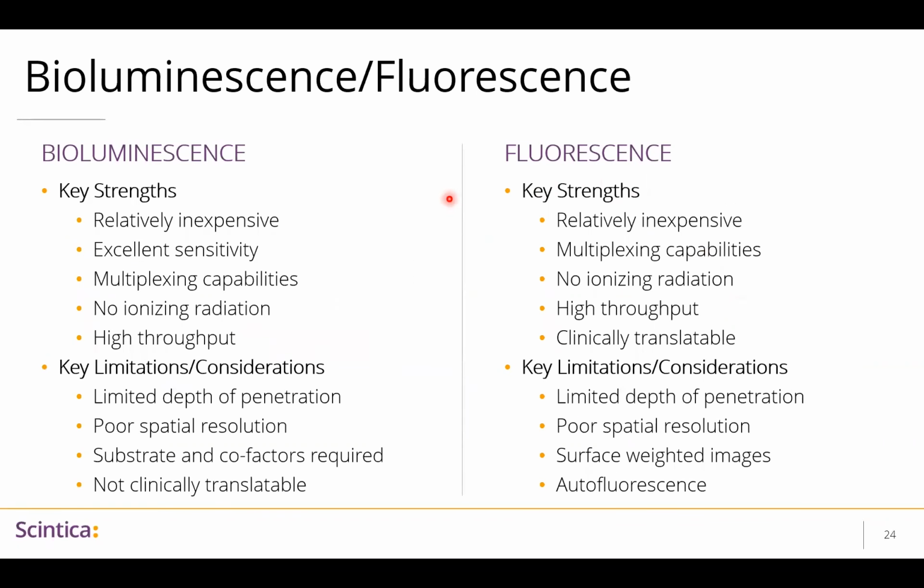So some of the common strengths between the two: they're both relatively inexpensive, relatively high throughput, with no ionizing radiation. In bioluminescence, there's excellent sensitivity. Again, both have multiplexing capabilities. Bioluminescence is not translatable into the clinic because we have to manipulate those cells to express the luciferase.